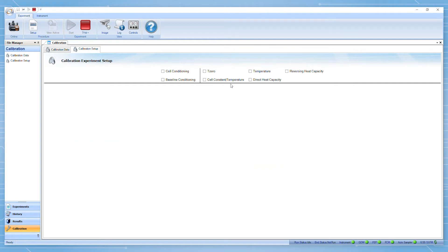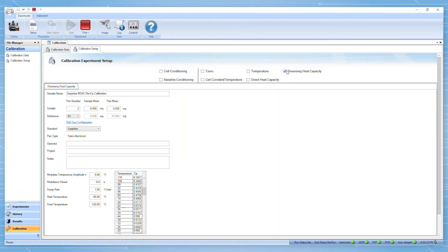Within the calibration setup tab, check the box next to reversing heat capacity. A tab to input your desired calibration parameters will appear. There, you can include information such as the sample name, operator, or any notes you may want to add.